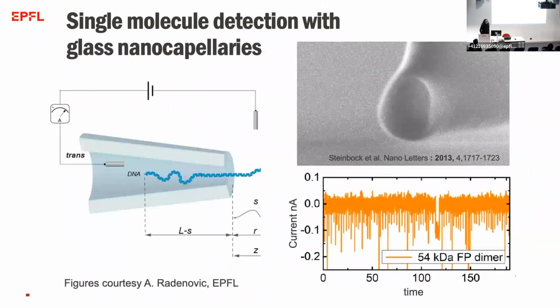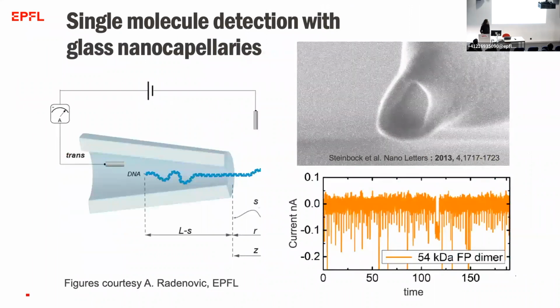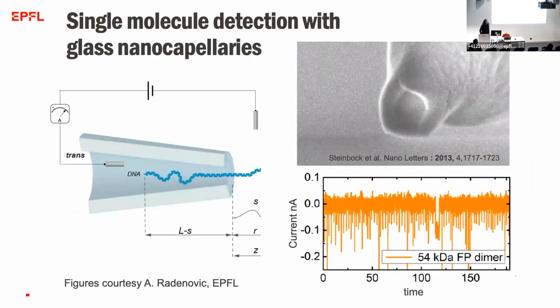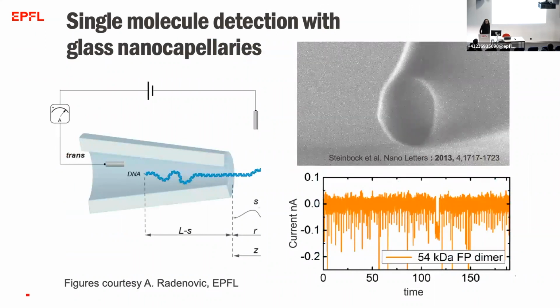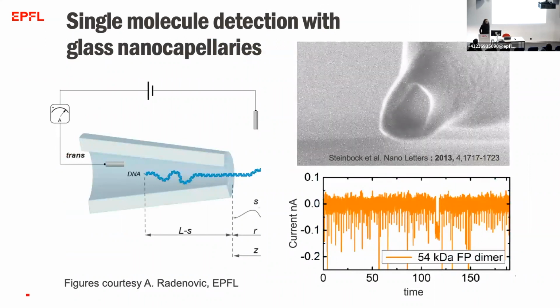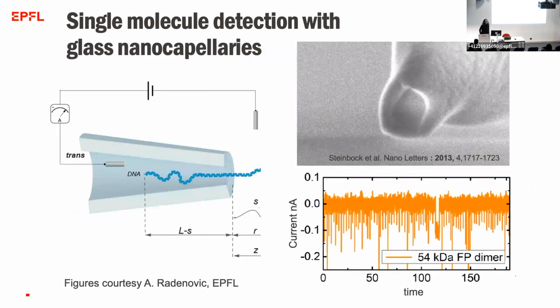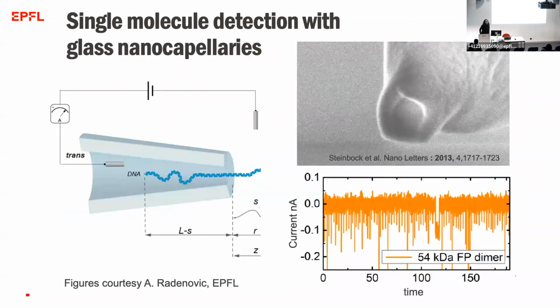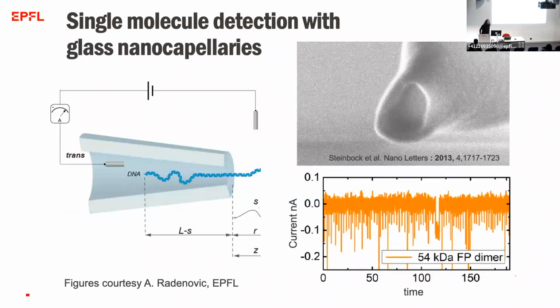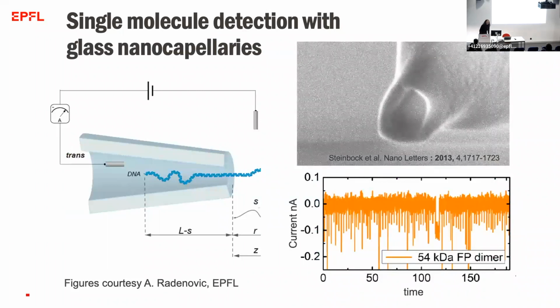Coming from the engineering point of view, and from the fact that we used these capillaries that you have seen as well as the imaging probes, we developed a process in 2013 by which we can shrink these pulled capillaries that have also been used by researchers in patch clamping.